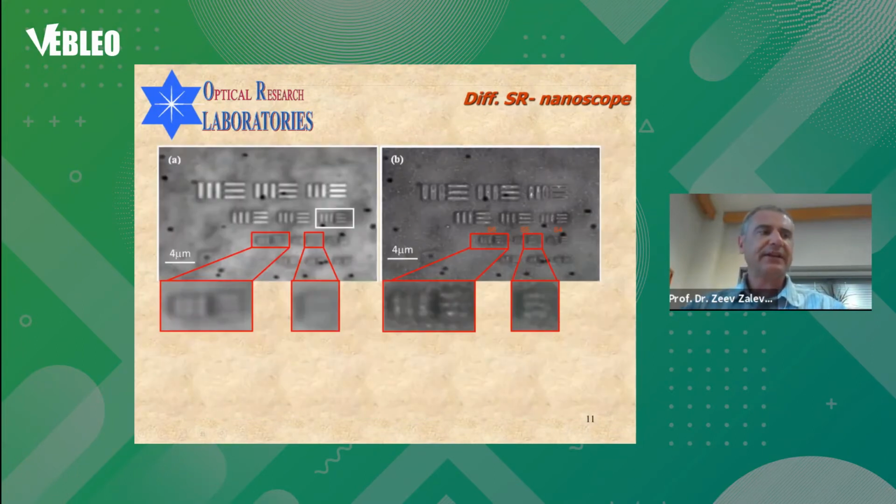One interesting thing is to take these super resolution concepts towards nanoscopy. What we do there is take a regular microscope and put metallic nanoparticles. They are nanometric and they are floating in the solution above the object we want to image. Those nanoparticles are our encoding pattern, because the encoding pattern doesn't have to be a grating, it can be a random pattern.